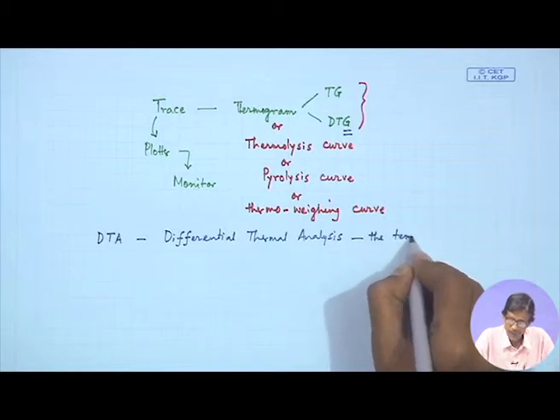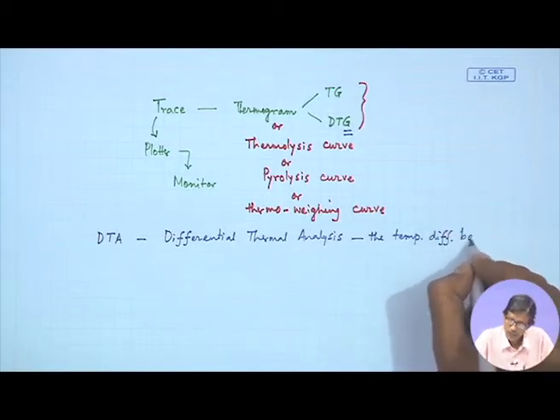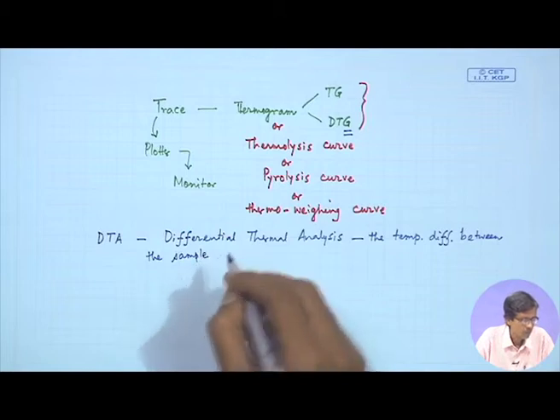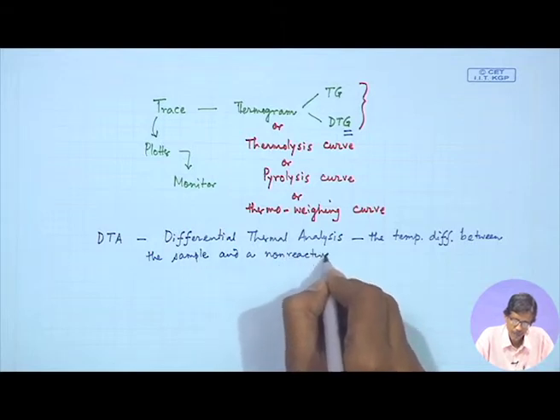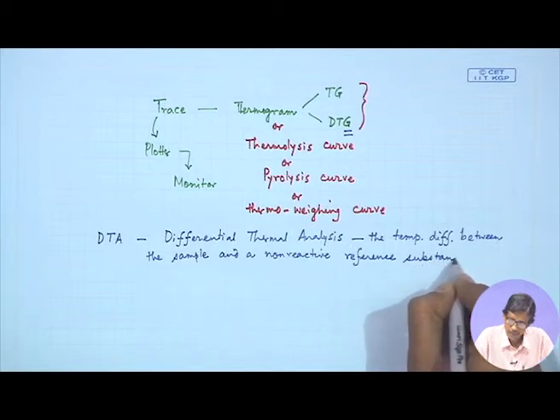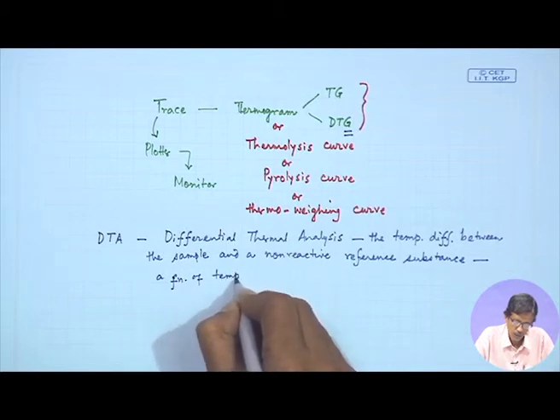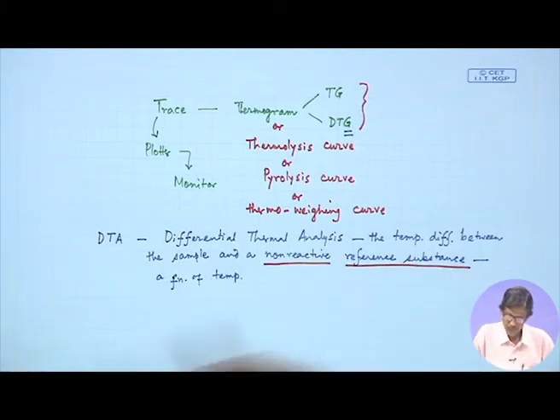So, the temperature difference we have to monitor between the sample and a non-reactive reference material or substance, which is again monitored as a function of temperature.